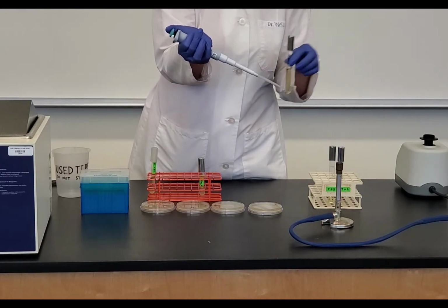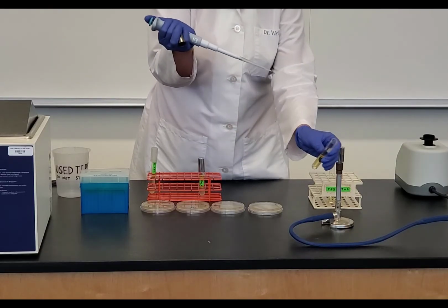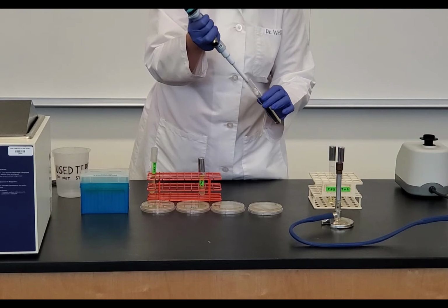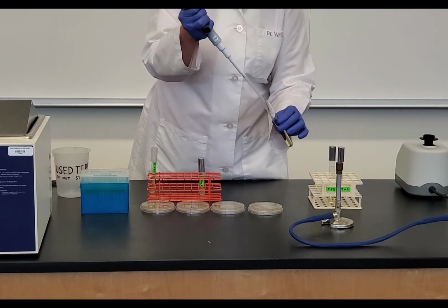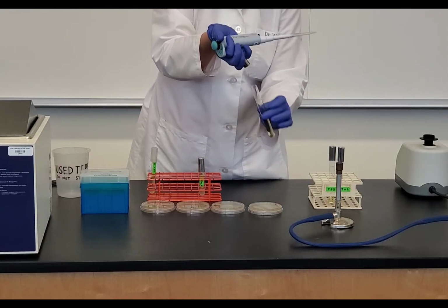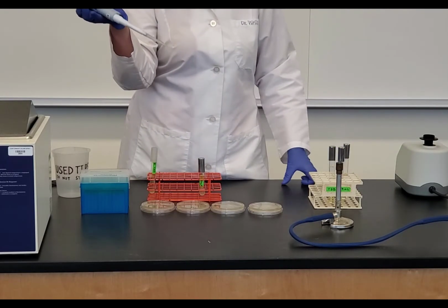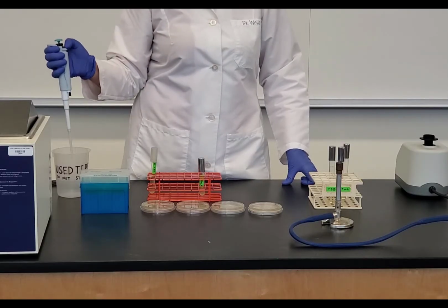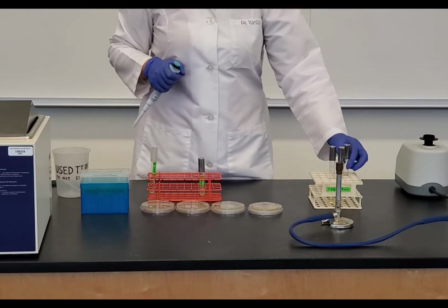Now I need to add it to my first tryptic soy broth. So I'm going to take the lid off, flame it, add it, push all the way to the second stop to get all of that liquid out, flame it, cap it. I'm going to move it in my rack so that I know that it's done. My tip, I'm going to eject in my tip waste. So I'm going to get rid of my tip.